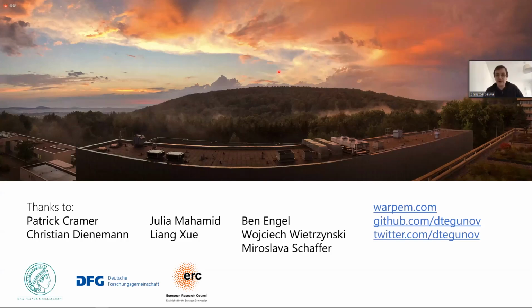Okay, and a further question. This is from Colin again. Does the noise-to-noise denoising in M use half sets of particles or odd and even movie frames like in Topaz? It uses just the usual half maps. I mean, this is basically what noise-to-noise needs: two independently noisy pieces of data showing the very same thing. And single particle analysis has had those two pieces of data since pretty much the very beginning.